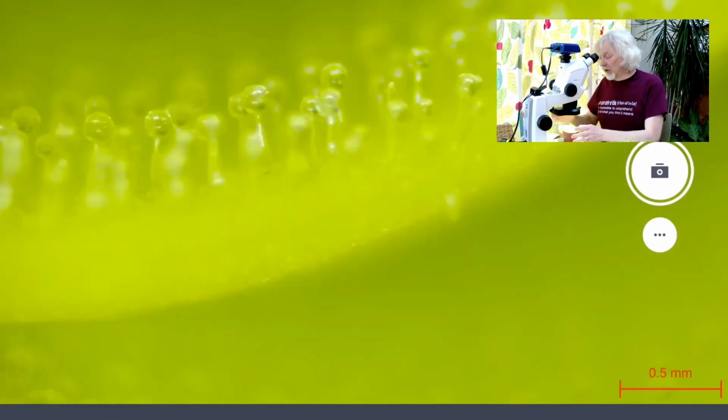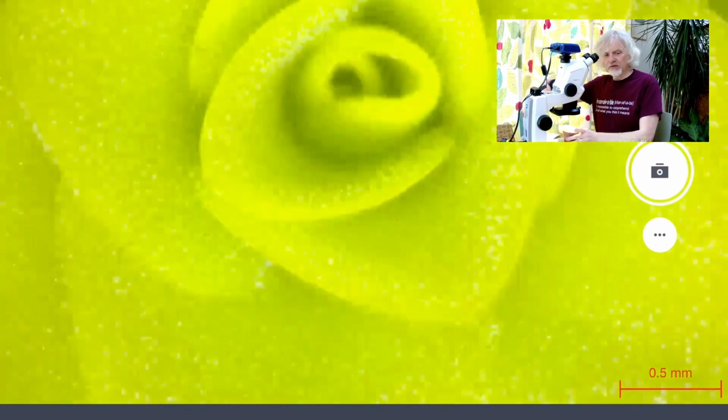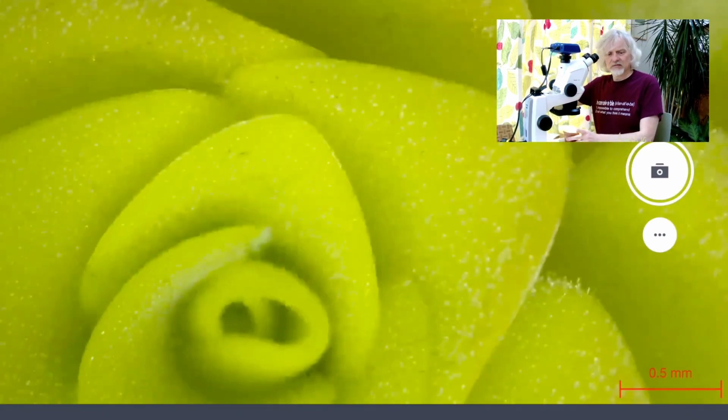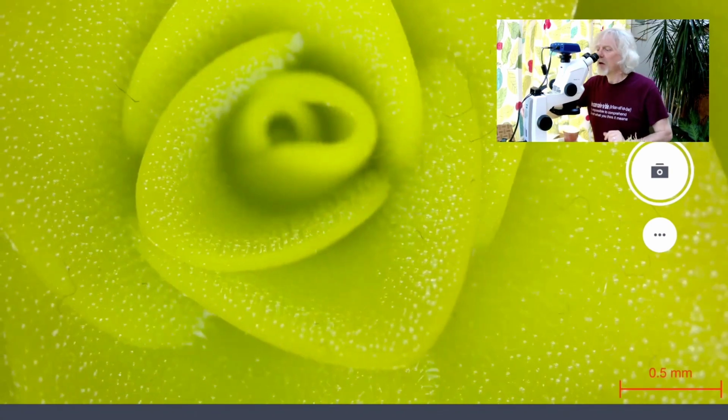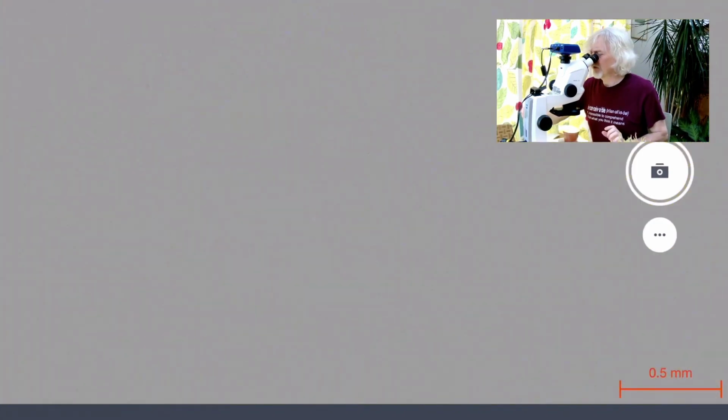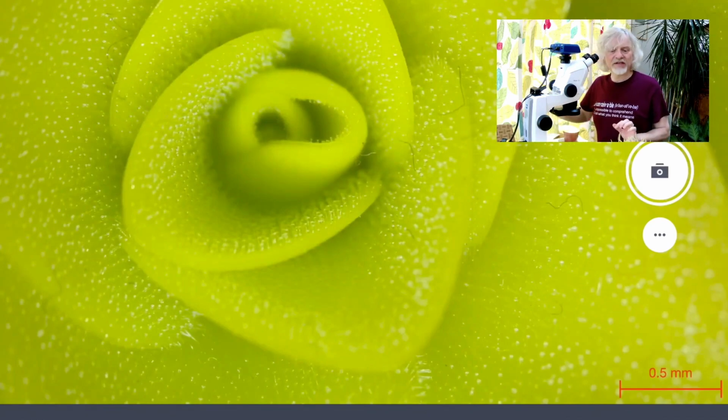So that's just a little look. Let's zoom out, because I think these are rather beautiful. Oops, where is it? There it is. Just focus on that like that. Isn't that pretty? I'll go right in on it. It's got the new leaves coming up in the middle.